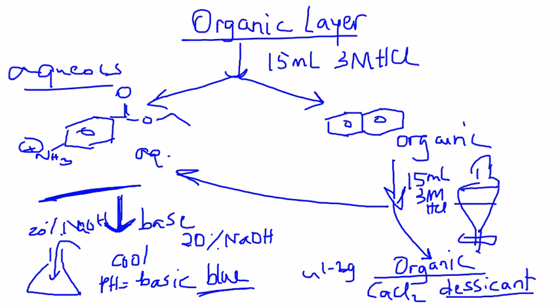Your aim is to saturate your system with calcium chloride because you want to make sure that there is absolutely no moisture remaining in your extracted material. Keep that as a rule for the future as well.